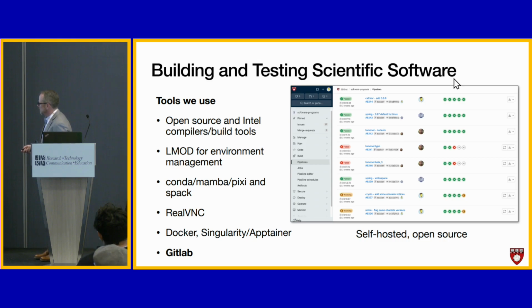I showed you the RealVNC dashboard on the previous page. We containerize some things. You don't really need to containerize SBGrid because we work really hard to make it run on bare metal, but still there's some real benefits to containerization. So we do use those tools internally and are working on some docs to roll that out a little more broadly.